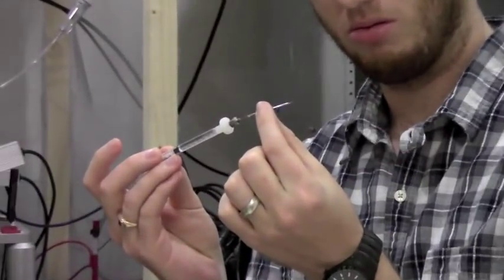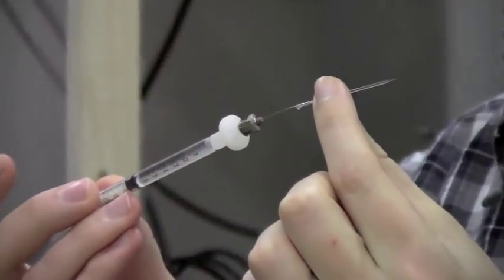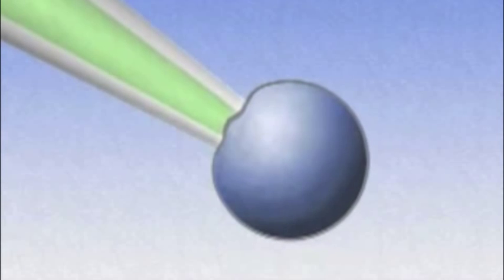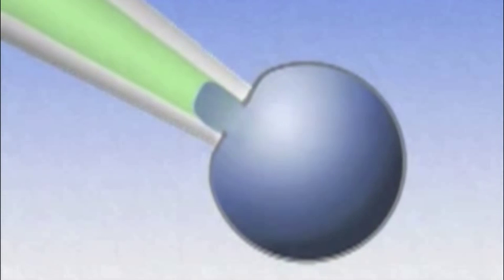Then, an electrode is inserted in the pipette. This will allow us to receive signal once we are inside the cell. To impale the cell, scientists can either apply a positive or negative pressure on the hollow pipette, depending on the experiment type. This is usually done by a machine, but some scientists do it by mouth.